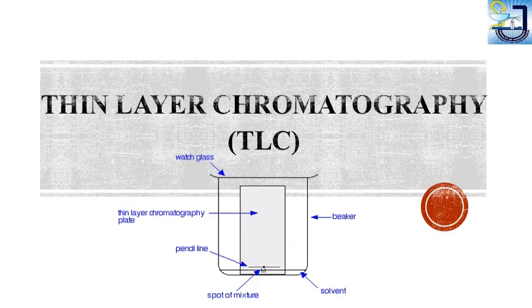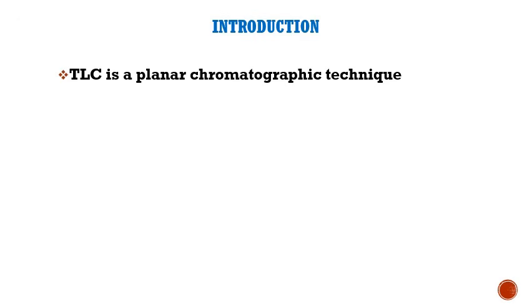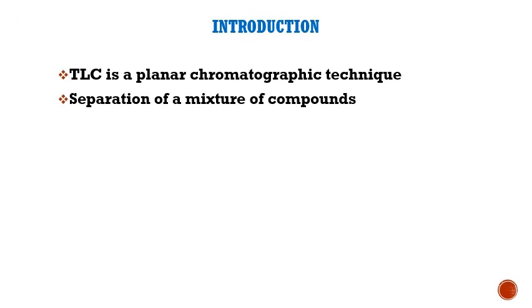Hello! In this section we are going to discuss thin layer chromatography or TLC. TLC is the type of chromatography in which the stationary phase is spread on a sheet, planar chromatography. TLC is a planar chromatographic technique in which the stationary phase is spread on a sheet.